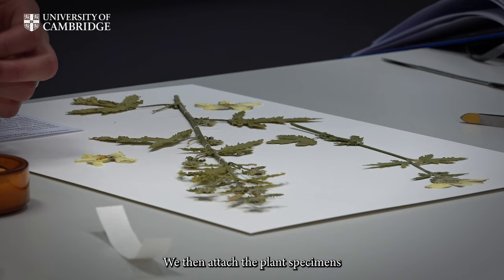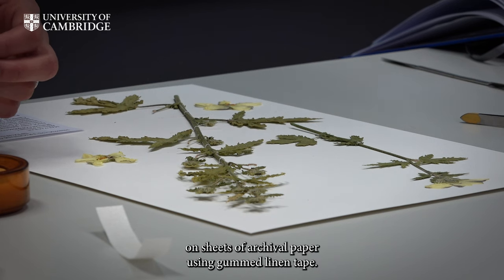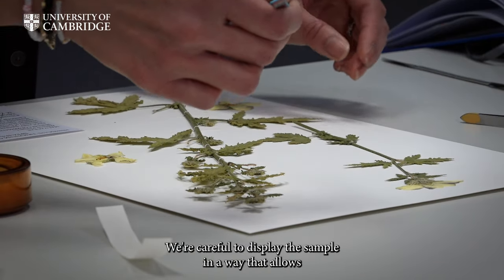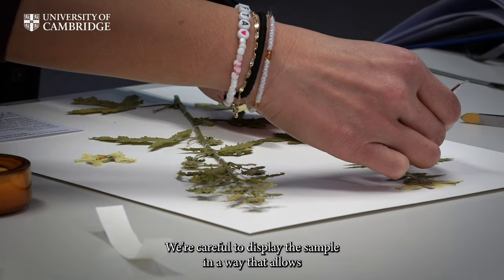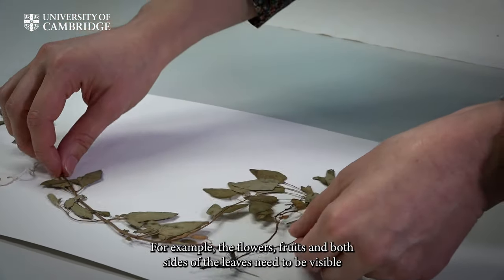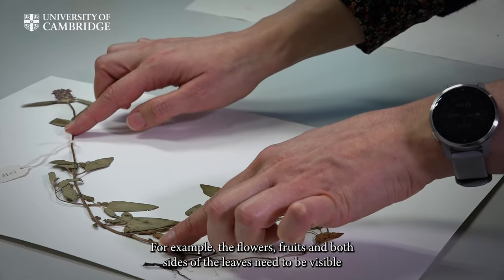We then attach the plant specimens on sheets of archival paper, using gummed linen tape. We are careful to display the sample in a way that allows for all the important identification characters to be accessible. For example, the flowers, fruits, and both sides of the leaves need to be visible.